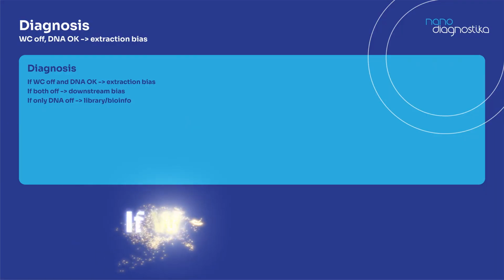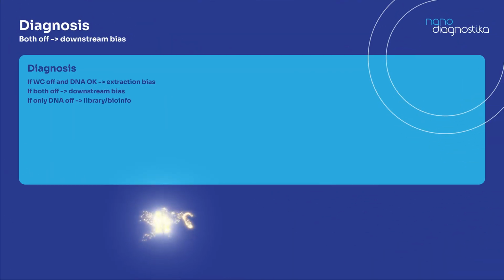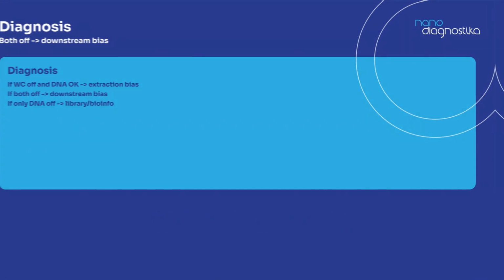If the whole cell standard shows a skewed community, say loss of gram-positives, but the DNA standard result looks correct, that discrepancy reveals the bias occurred during the lysis extraction stage. If instead both standards show a similar deviation from expected, the problem must lie in the downstream step common to both. For example, a PCR bias, or a bioinformatic error affecting both runs.